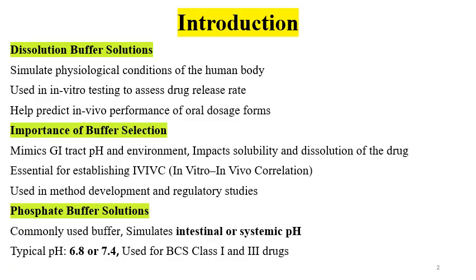Dissolution media as buffer solutions simulate the physiological conditions of the human body and are used in in vitro testing to assess the drug release rate. The buffer solutions help to predict the in vivo performance of the oral formulations. As we know, dissolution testing is an in vitro testing to predict the in vivo behavior of the formulation. Selection of the dissolution media, and specifically the buffer solution as a dissolution media, is very vital, important and critical.